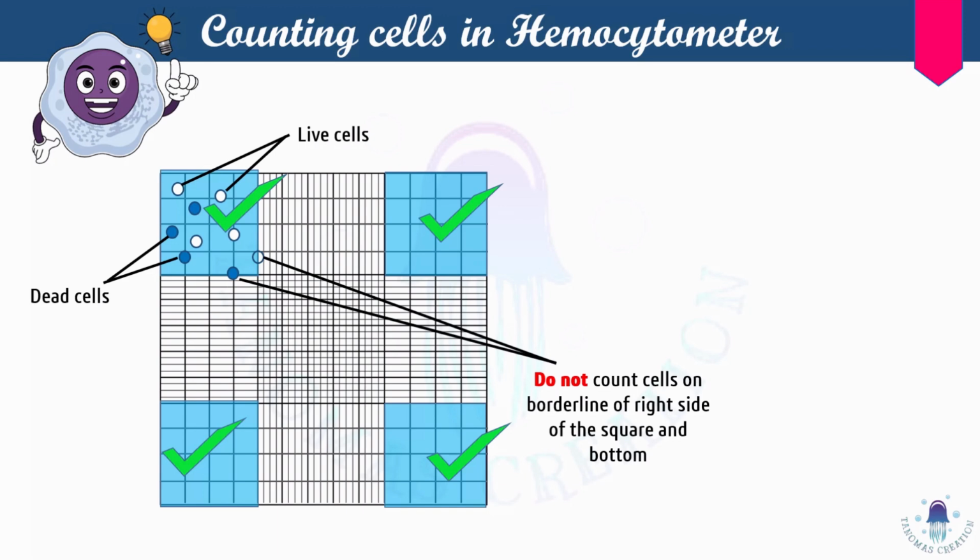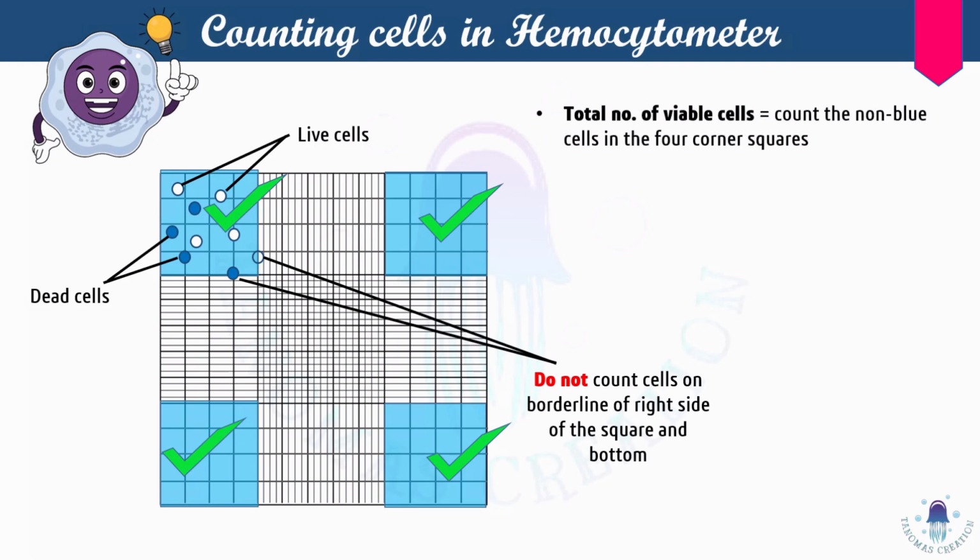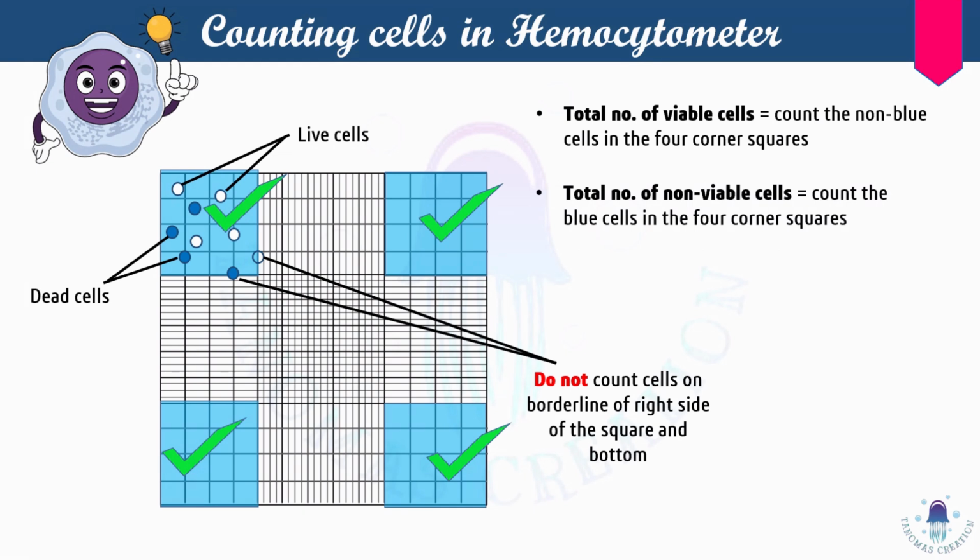So there are some formulas that are given for this counting. If you want to find the total number of viable cells, we need to count the colorless or non-blue cells in the 4 corner squares. And in order to find the total number of non-viable cells, we need to count the colored cells in the 4 corners. By adding these two, we will get the total number of cells. So the total number of cells equals total number of viable cells plus total number of non-viable cells.